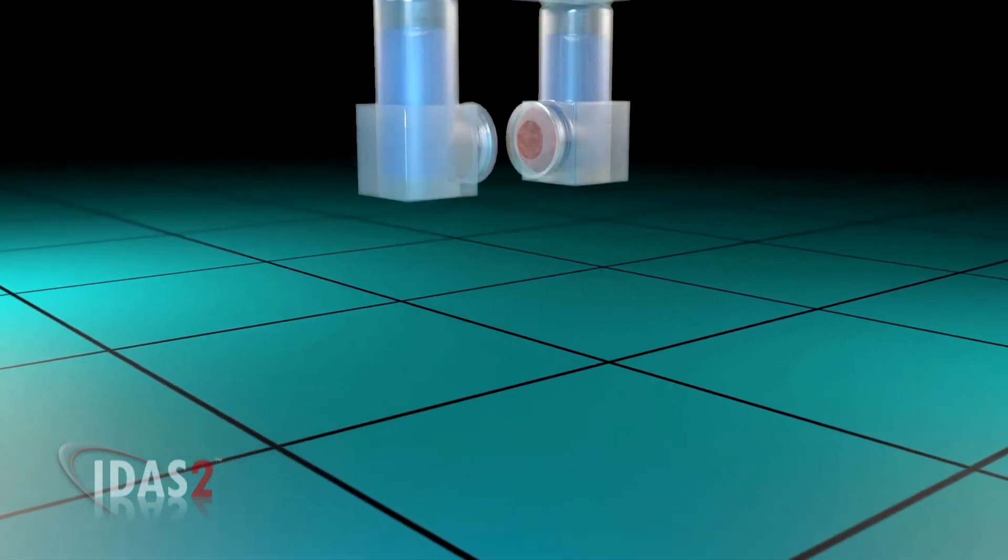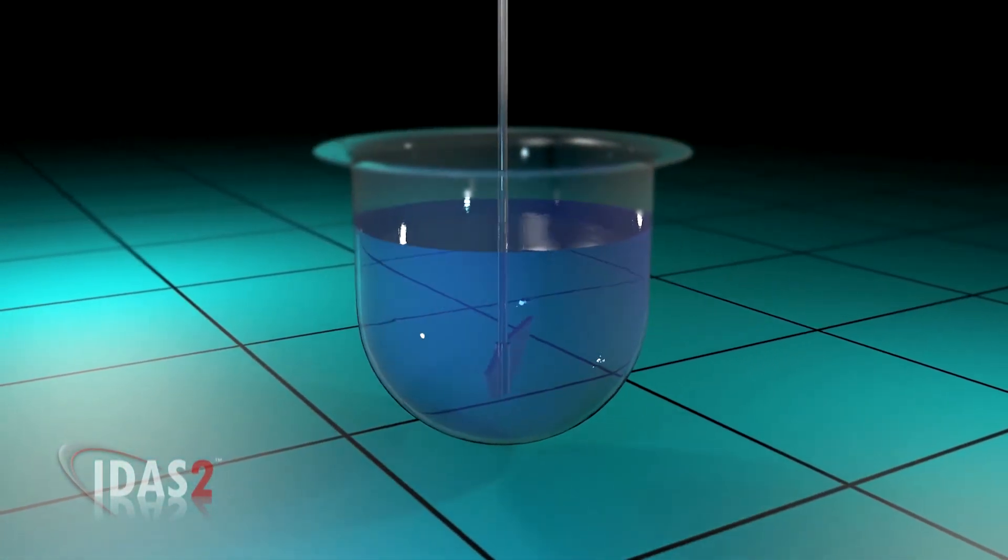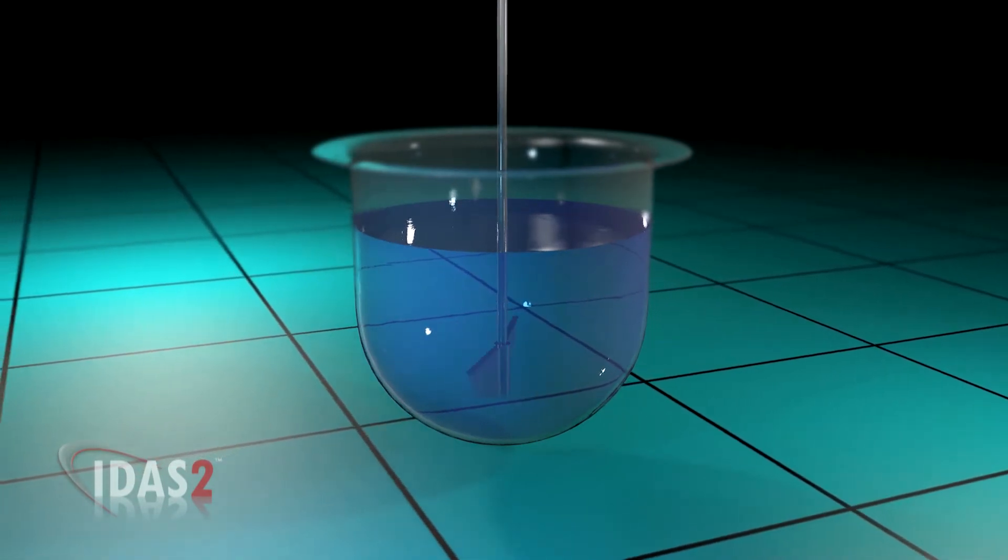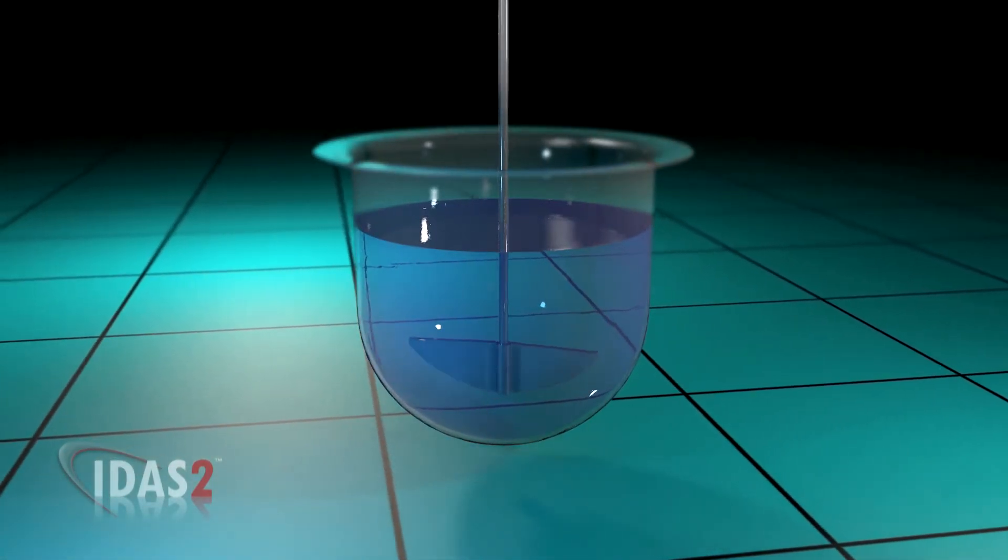Two IDAS2 units are then mounted onto a specially modified dissolution vessel cover and lowered into the 500 milliliter dissolution vessel.